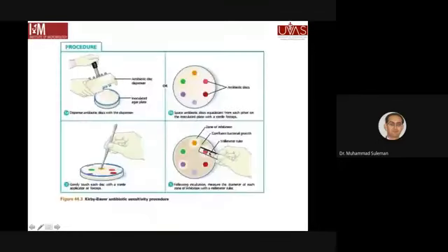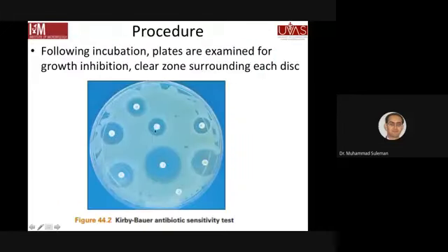और हर की जो है ना वो आपने जिस तरह पिछले में दिखाया था ना कि डिफरेंट जोन ऑफ इनहिबिशन है, तो आपने सबकी जो है वो जोन ऑफ इनहिबिशन मुहैया करके तो आपने रिपोर्ट करनी है. जो रेजिस्टेंट है वो भी रिपोर्ट करना है.